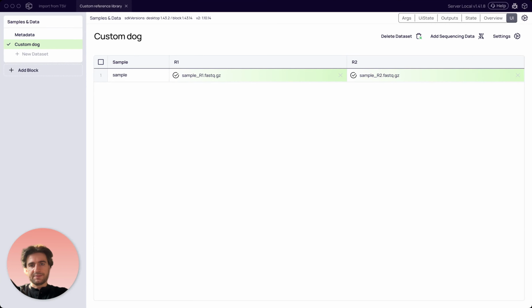Hi, in this video tutorial, I'm going to show you how you can analyze your immune repertoire data if you work with non-model organisms. For that, you would need a reference library, a custom one, and you can create it inside the Platforma. So here, I have a sample already added. This is a sample of IgH repertoire of a dog.